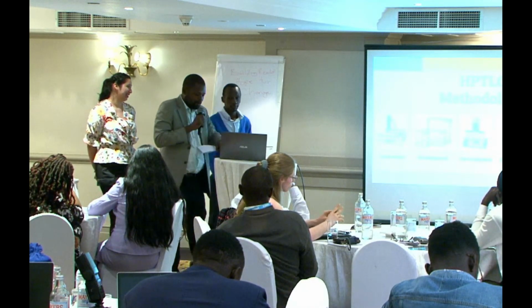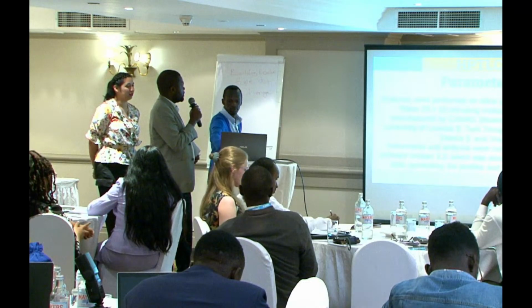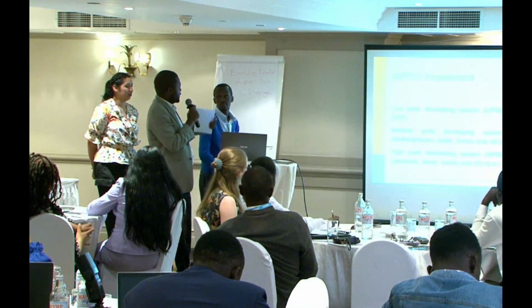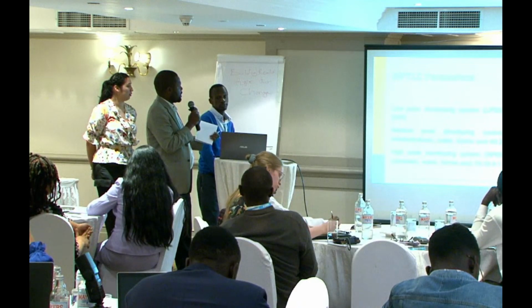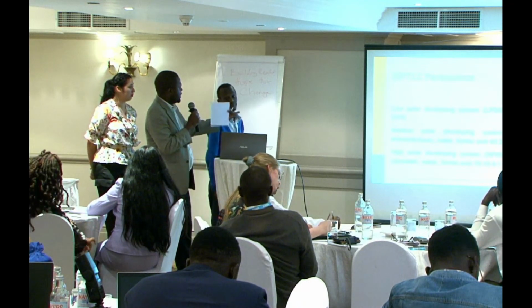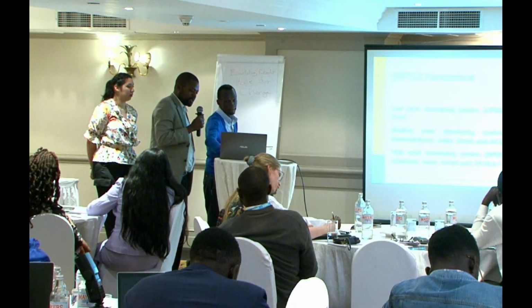So I won't talk much about that because everybody has spoken about it. Just move forward. Move again. Yes, for low polarity and medium polarity, those were the solvents: toluene, ethyl acetate, we worked on it, and then diethyl ether and tetrahydrofuran, water and formic acid. So I won't dwell much on that.